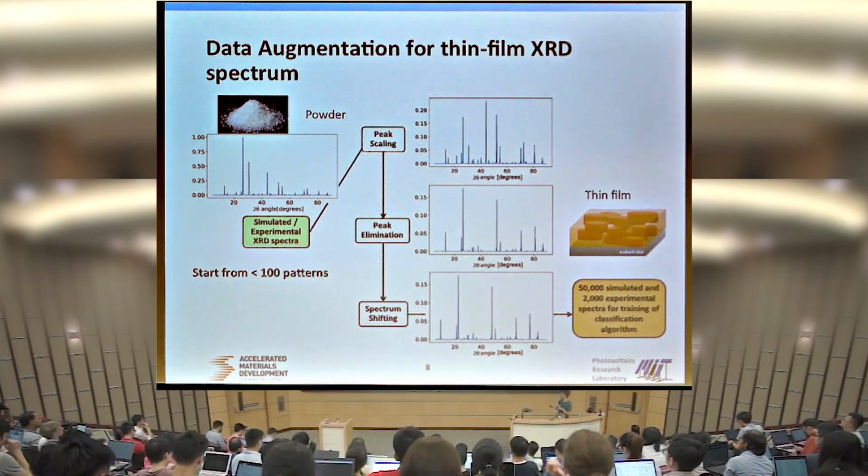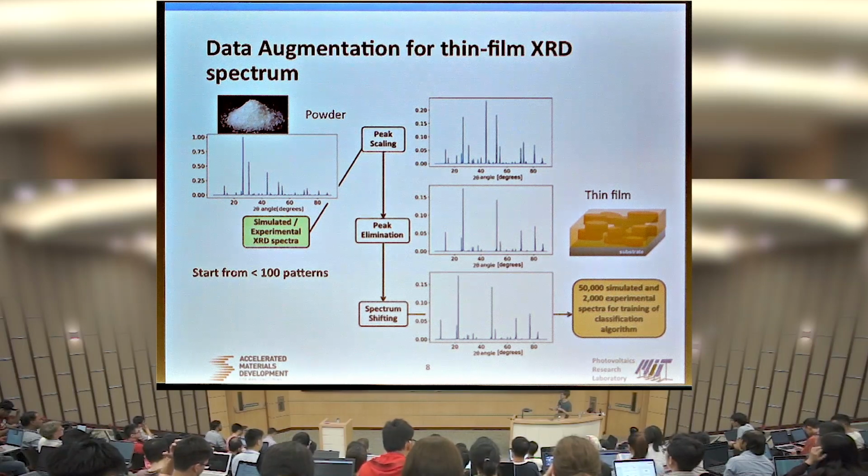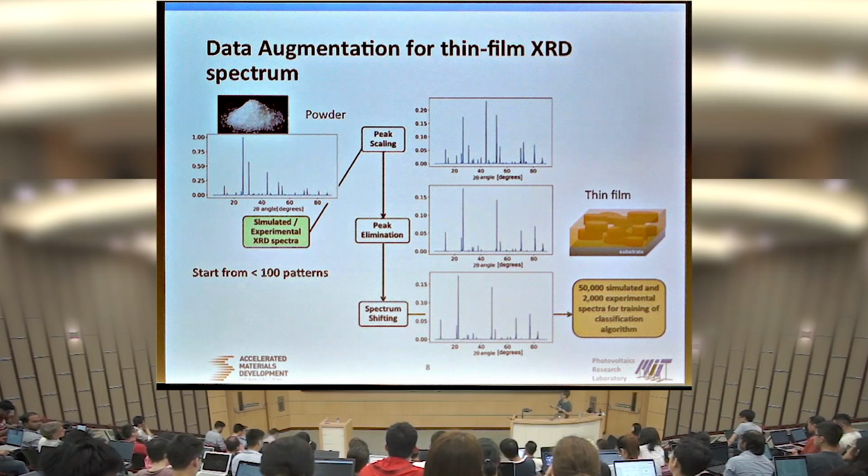So you could say for the measured spectra, this crystal orientation does not exist within this same film, so that peak may just disappear compared with a complete powder spectra. Also, the peaks along the preferred orientation will get magnified, so there will also be scaling of the peaks.